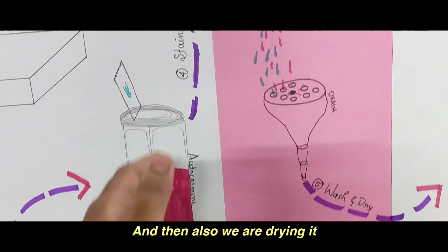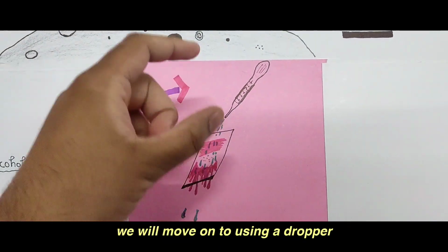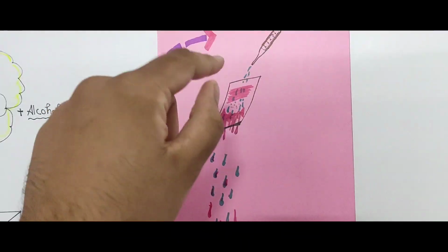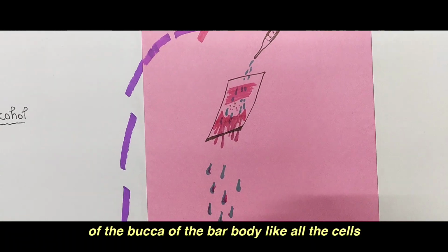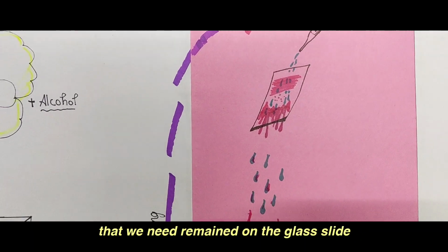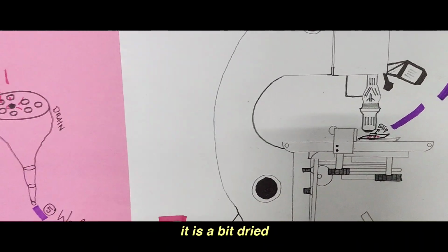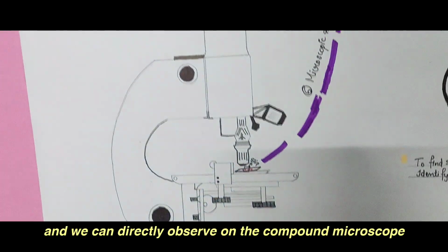And then also we are drying it, and after drying we will use a dropper and distilled water or direct running water, and we will slowly wash the stain off, so that small parts of the buccal cells, the Barr body cells that we need, remain on the glass slide. Then after washing, when it is a bit dry, we can use a cover slip and directly observe on the compound microscope.